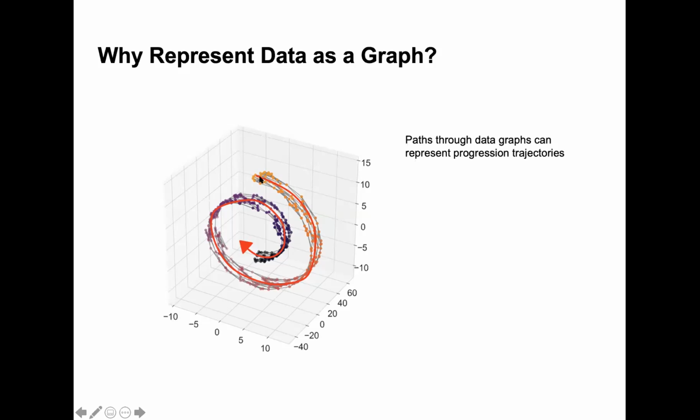In tomorrow's lecture, we'll talk about diffusion, which is a probabilistic way of taking a walk through the graph. And you're going to compute probabilities of getting from one point to another. And that will emphasize very major pathways in the data.